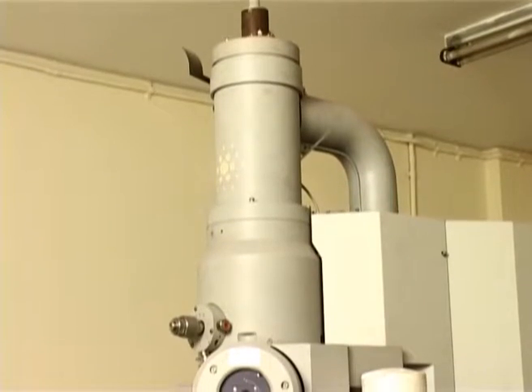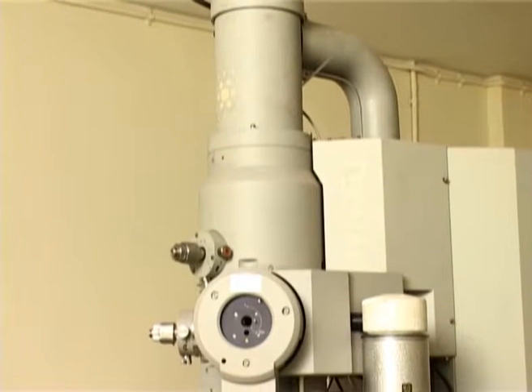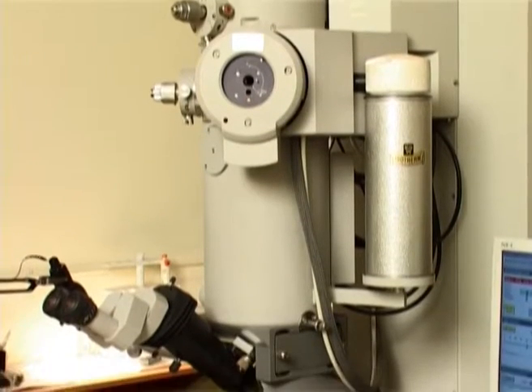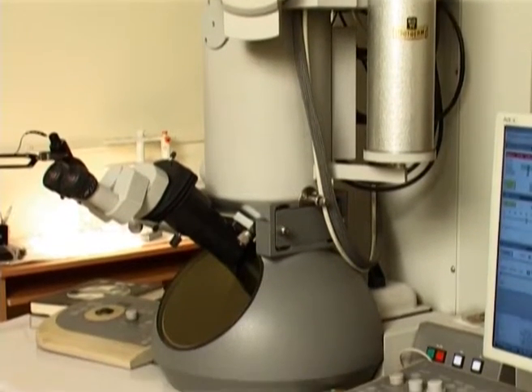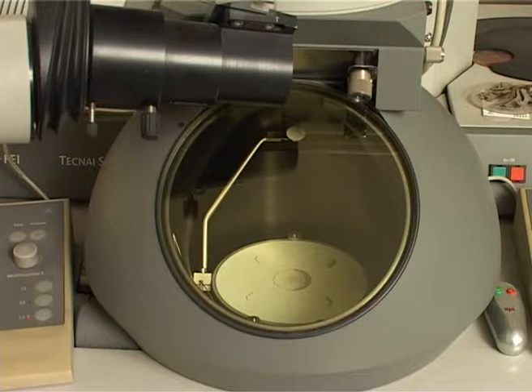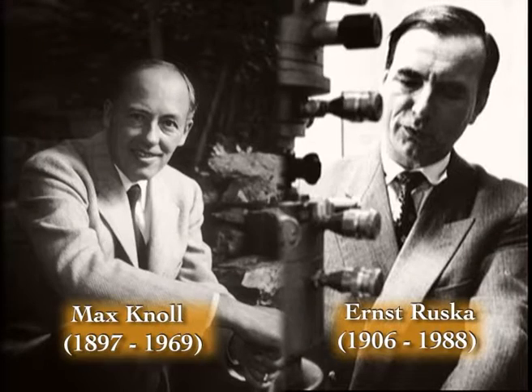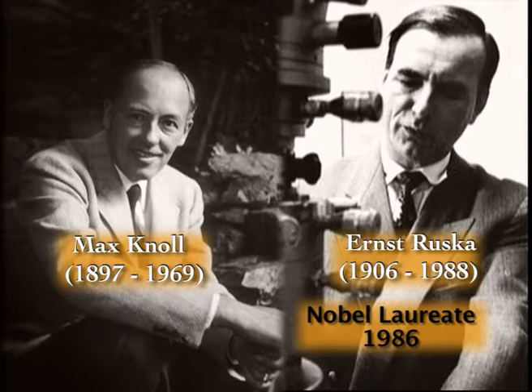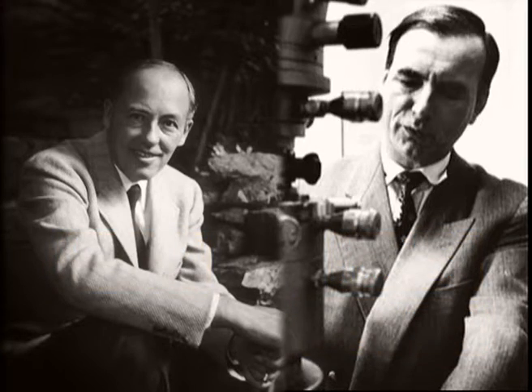A typical electron microscope will have an electron gun, due to which the electrons will come and impinge on the object, and then it will get scattered or get reflected from the object, and that can be focused by objective lenses and visualized on a fluorescent screen. The first prototype of electron microscope was made in 1931 by Ernst Ruska and Max Knoll. It was Ruska who received Nobel Prize in 1986 in physics for his discovery of the electron microscope.